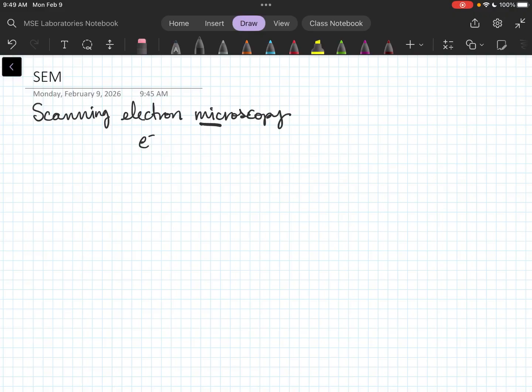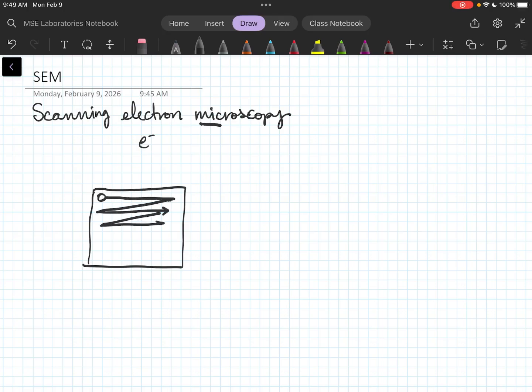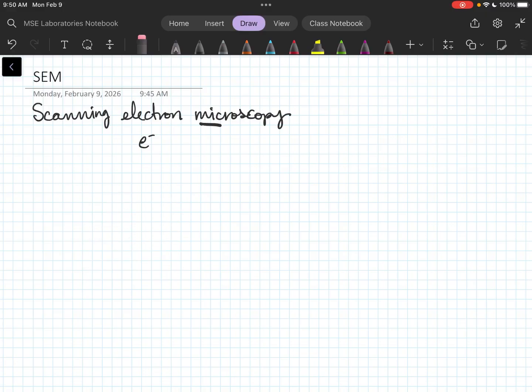The easiest way to describe this is very old video games. Have you ever seen a 90s era video game where the screen loads, starting in one corner? You've seen that happen before? Yeah. That is called rasterizing. That's an important word.